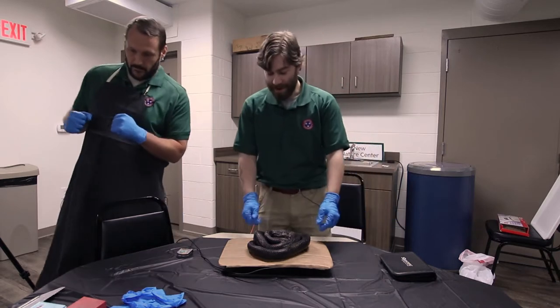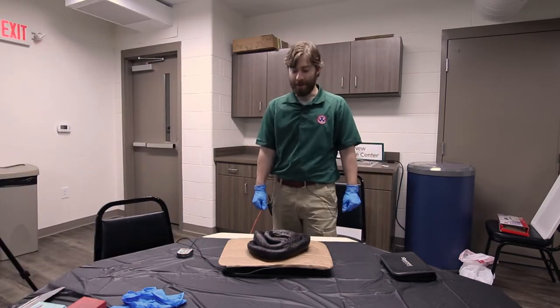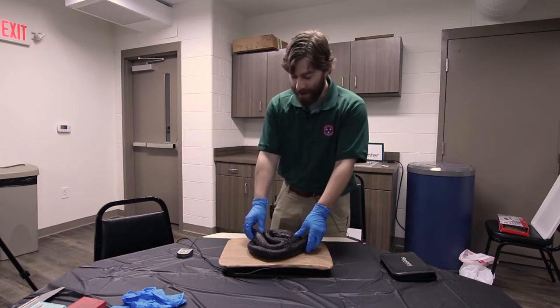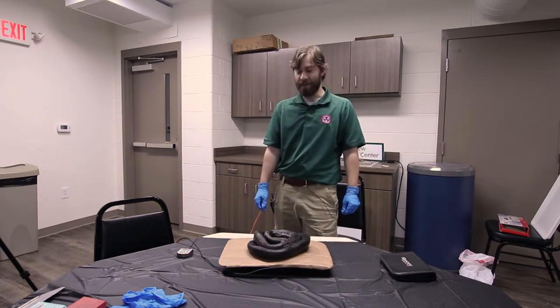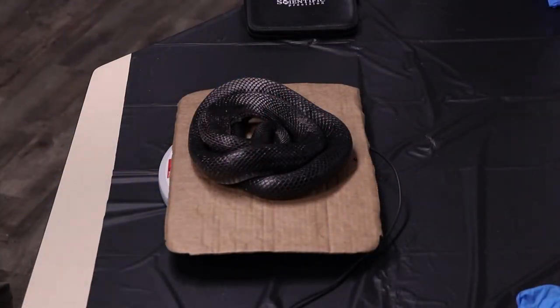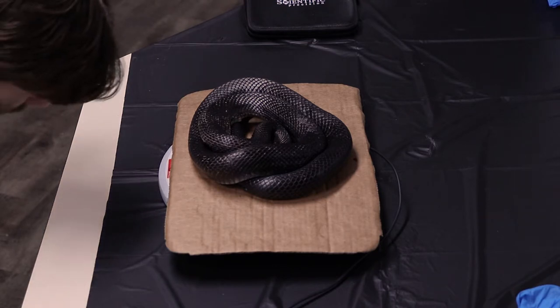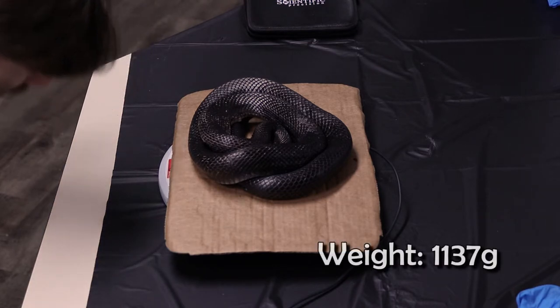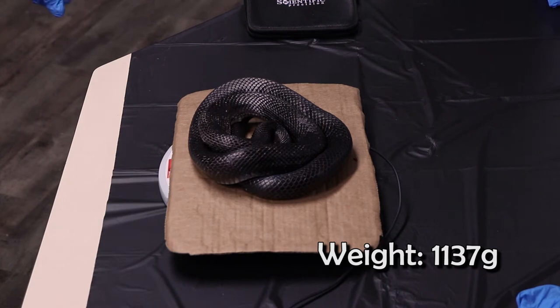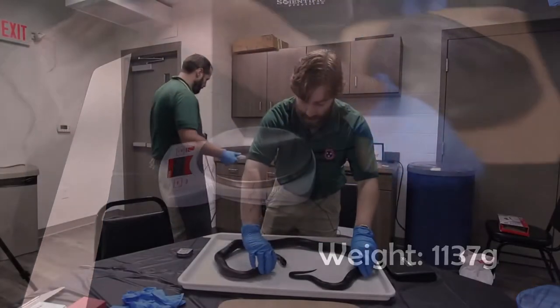Alrighty, so let's get started. The first step in any dissection, especially if you're going to do research on it or if it's going into collections, is to take the weight and measurements of the animal. Here we have a scale that's in grams, and we already have it set up, and I believe it is 1,137 grams. So if you can jot that down in your notepad. Got it.